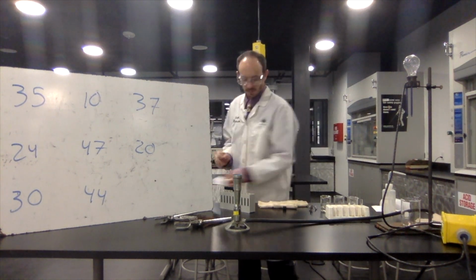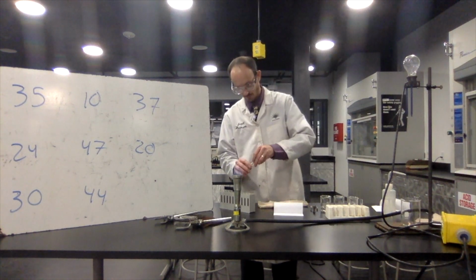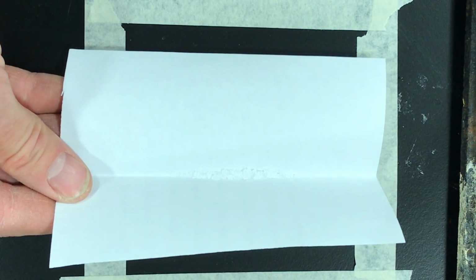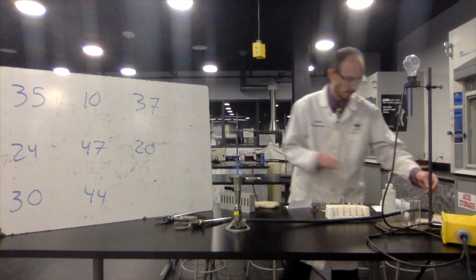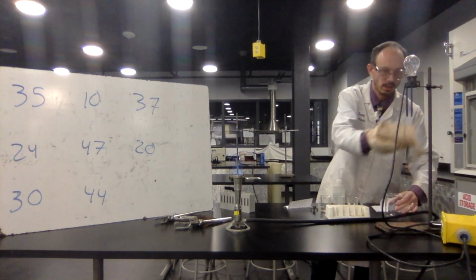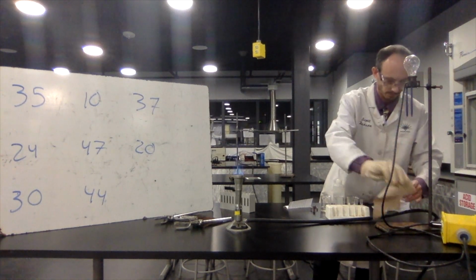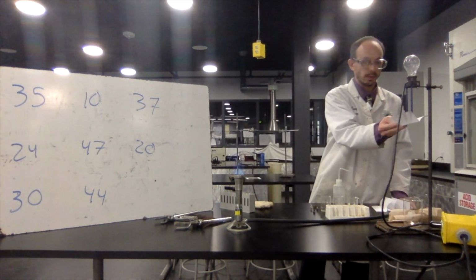Okay. I'm going to create my line on there. All right. I'm going to show you that line right here. So it's going from there to there. Let's test it. The last one had electrical conductivity, so we better wash and dry our probes. Okay. Let's see.